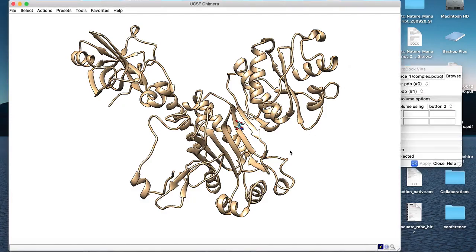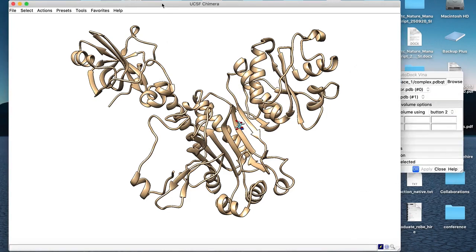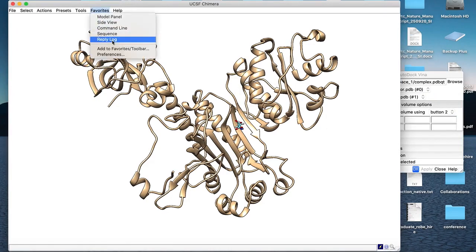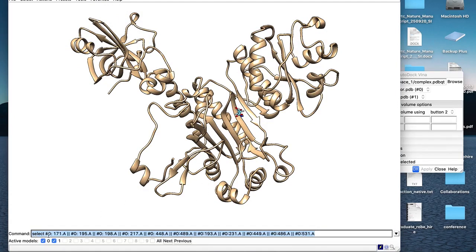We need to create a box around the binding pocket, so let's redefine it first. Using the command line from the Favorites menu, we can select specific residues. The syntax is: hash-zero (model number), colon, residue number, dot, chain ID. For example, #0:171.A is the 171st residue in chain A of the receptor. The binding site residues annotated are 171, 195, 198, 217, 448, 489, and so on — these are posted in the slides for reference.